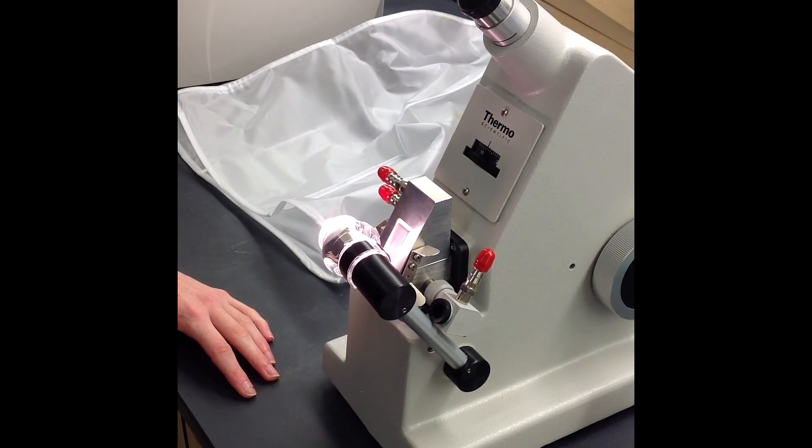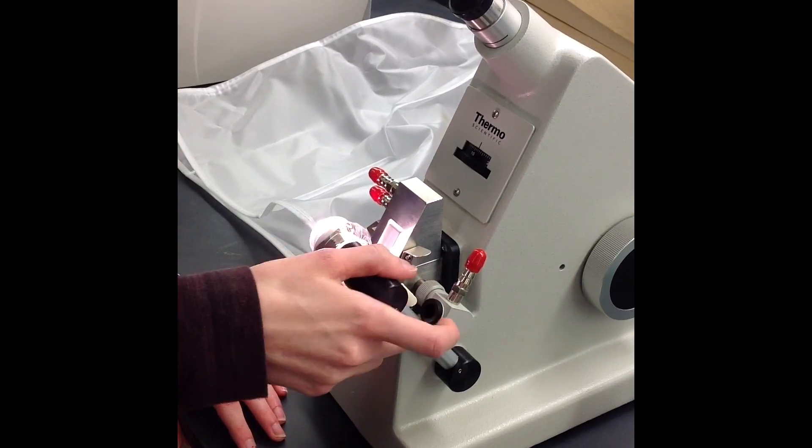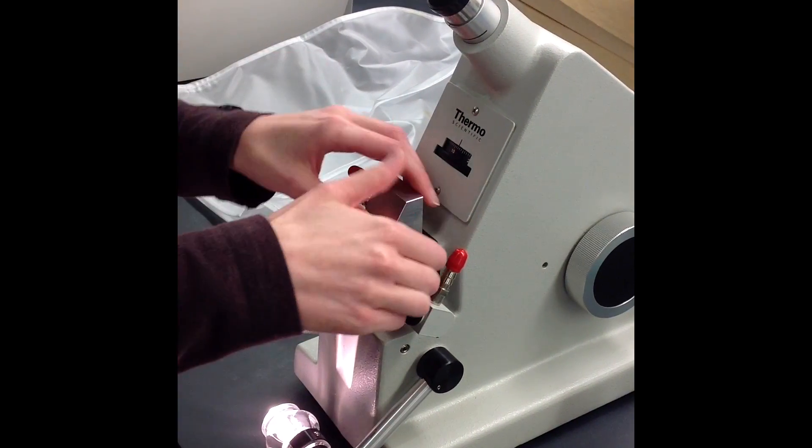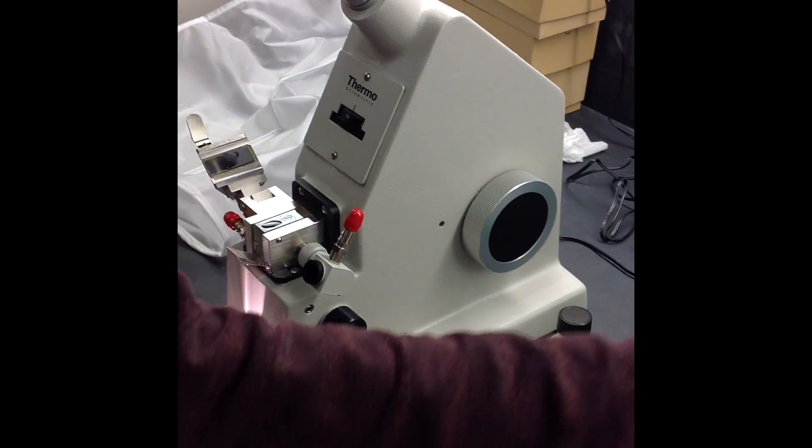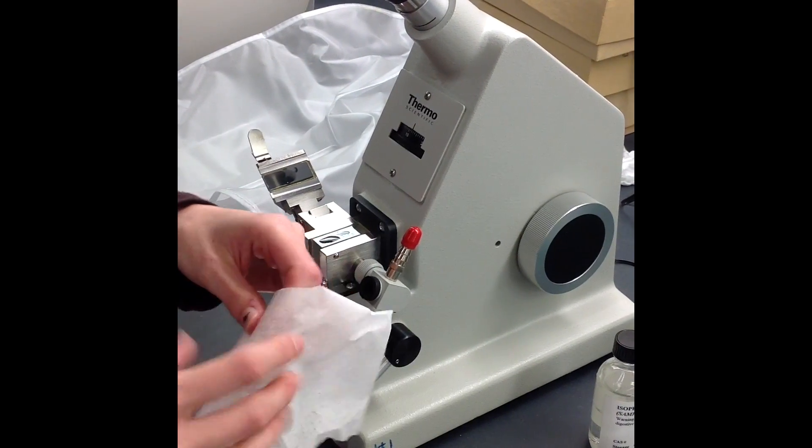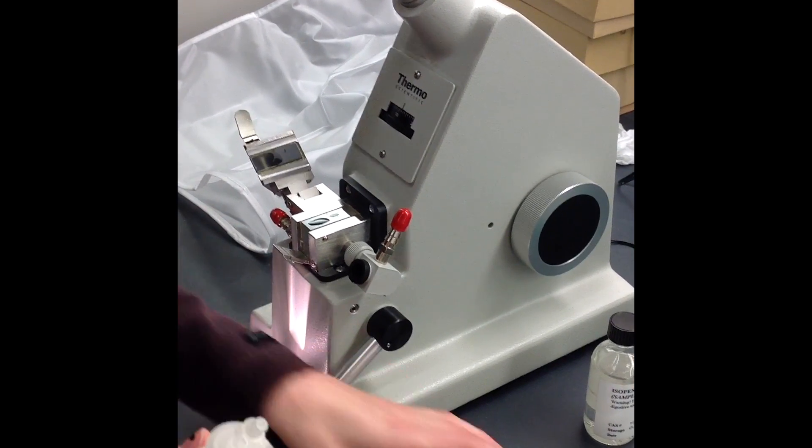Now that you've taken your reading, it's time to clean off the prism. I'm going to lower the lamp, flip this open, take a chem wipe, and add the denatured ethyl alcohol - just a couple drops.